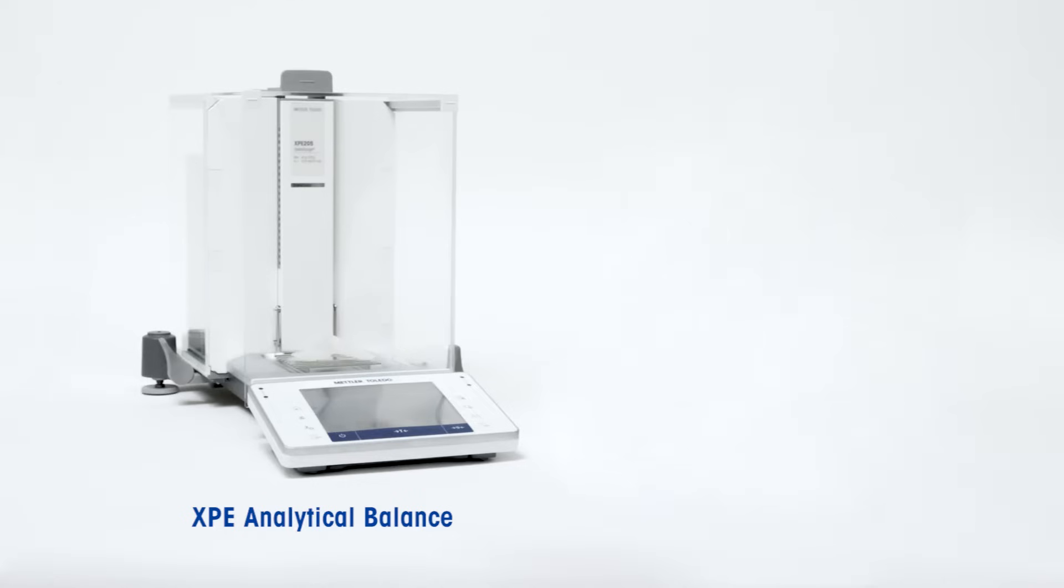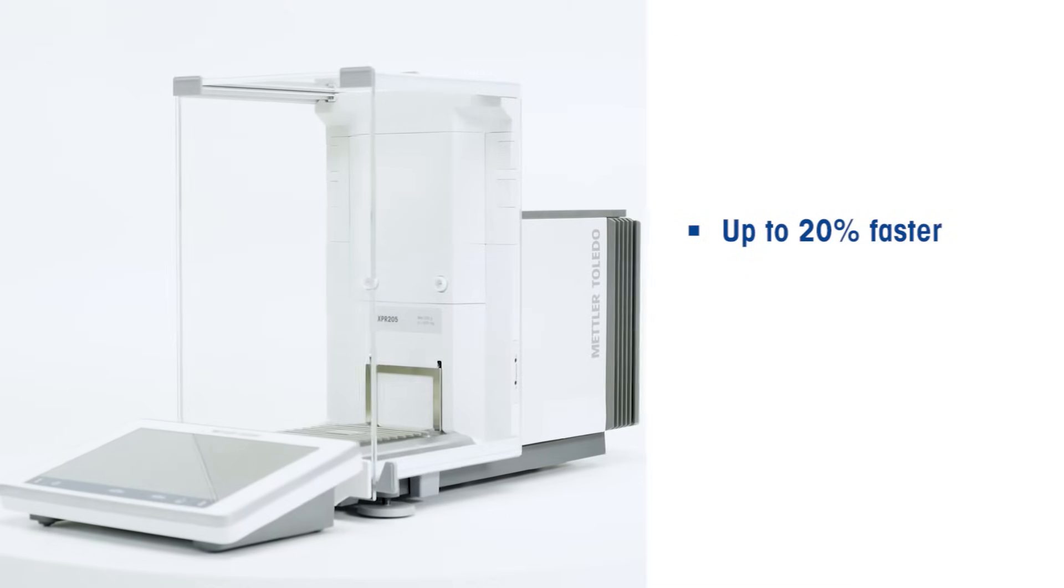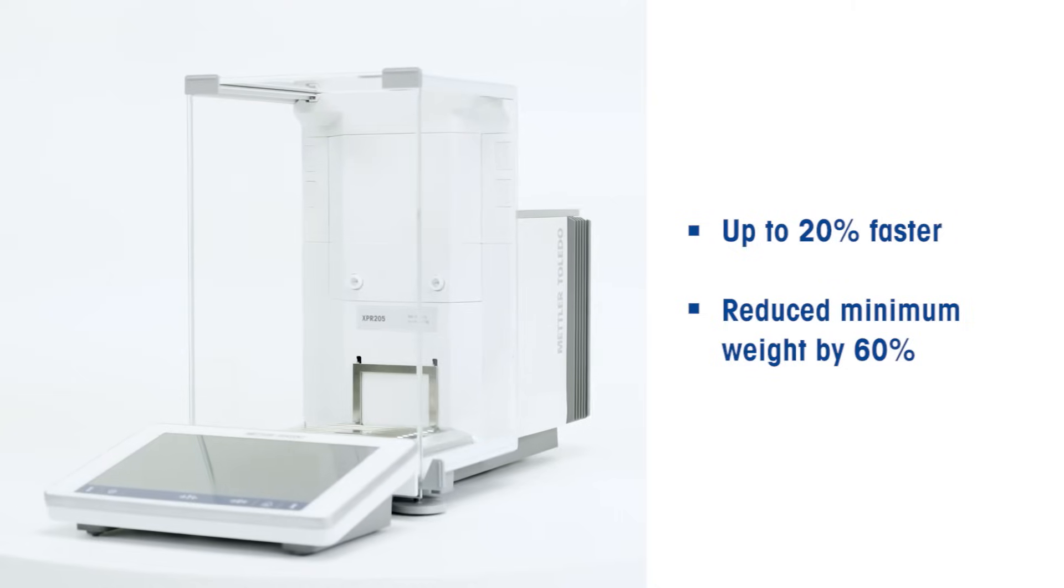Compared to its predecessor, the XPR is up to 20% faster, while at the same time, the minimum weight at the same capacity has been reduced by as much as 60%.